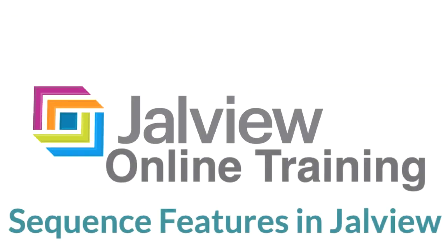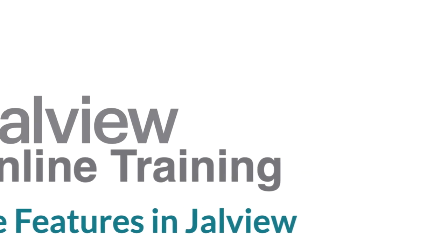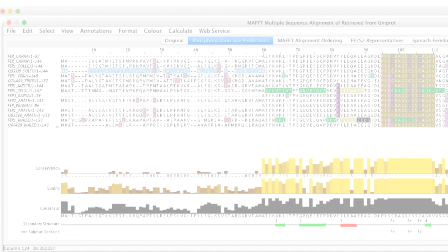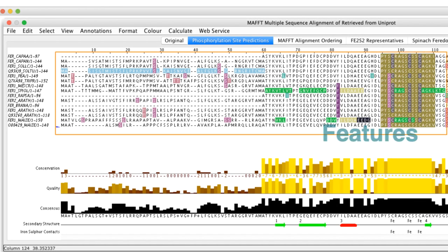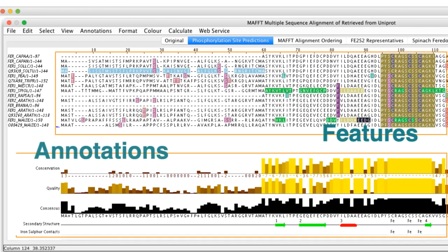In this Jalview online training video, I will consider displaying sequence features on the alignment. Jalview can display additional information as features on the alignment or annotation rows below the alignment.